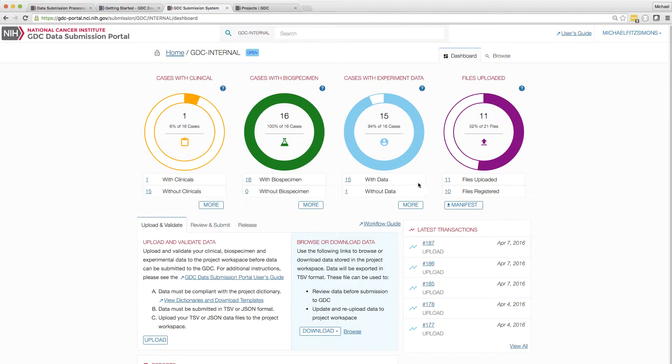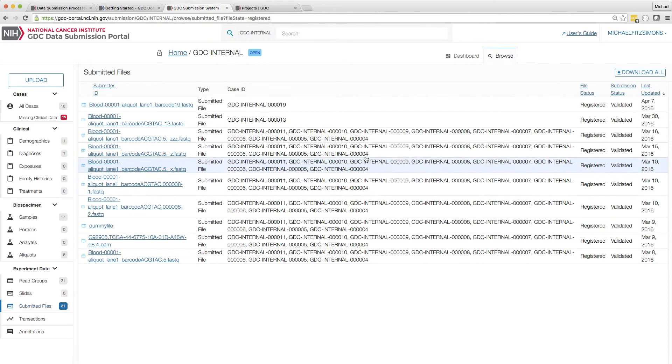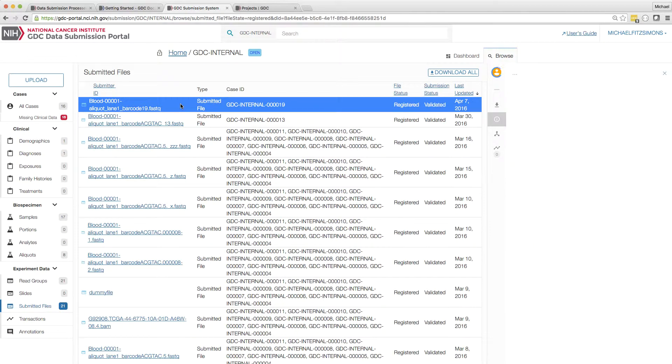In this example, I have already registered my files, which includes providing the checksum and file name. This may have been done through either the Submission Portal or API.